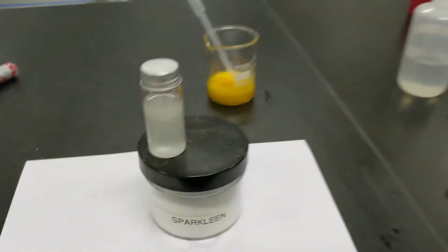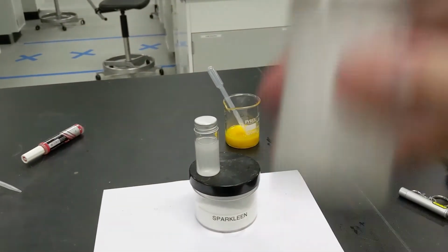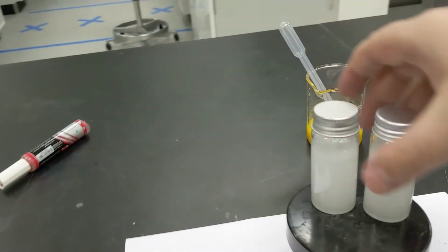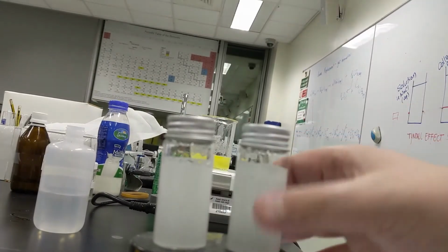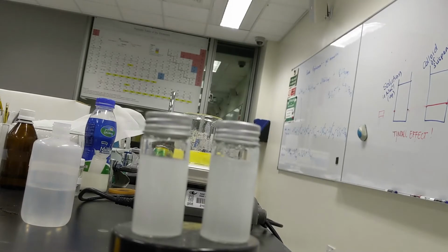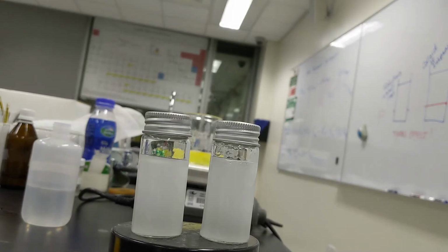So just to prove to you that these will not mix from shaking, I'll give them a good shake. So shake, shake, shake. Nothing has been mixed with these yet, not one chemical. And what I'll do is I'll leave this here, and we'll just watch what happens over the next few minutes with this as kind of like a time lapse. So I'll be right back, but you guys just watch what's happening in these.